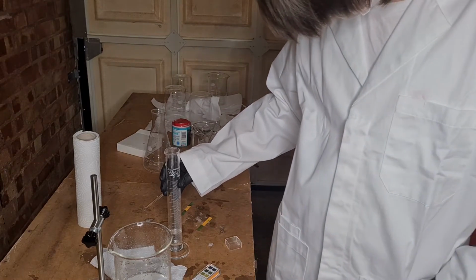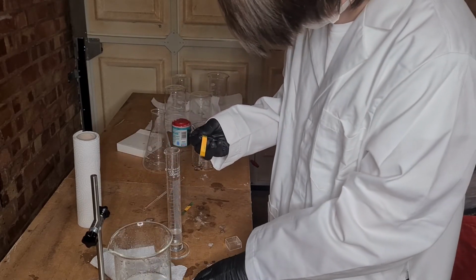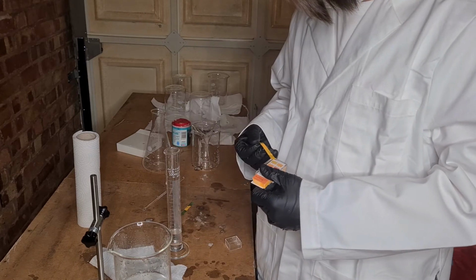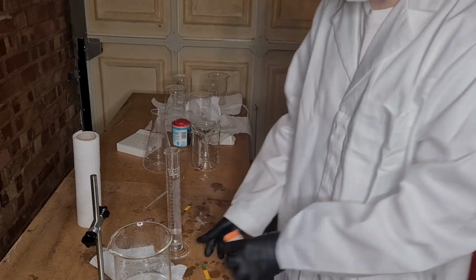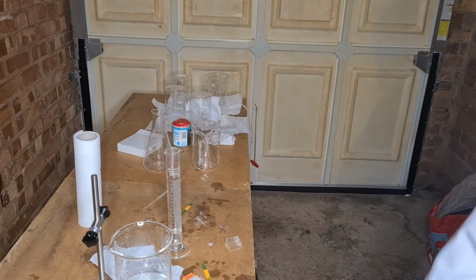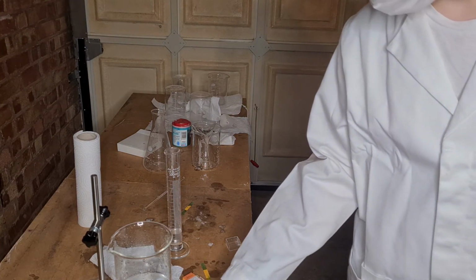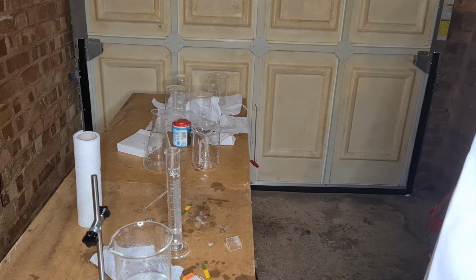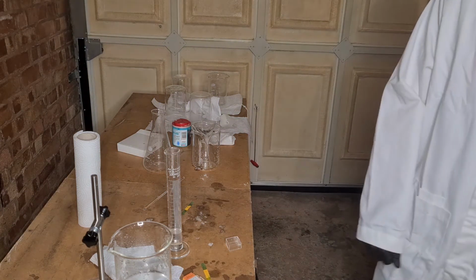Now we can assume that there's basically just trace amounts of sodium bicarbonate left in this, and I've messed it up and the solution is going slightly acidic. Maybe around a pH of 7, that's perfect. Right. So now what we can do is turn the heat on and start boiling this thing off. And the only real issue is you can't actually tell what temperature it is. I have to kind of assume it's a temperature that's workable. But that should start boiling, and I will leave this to it.